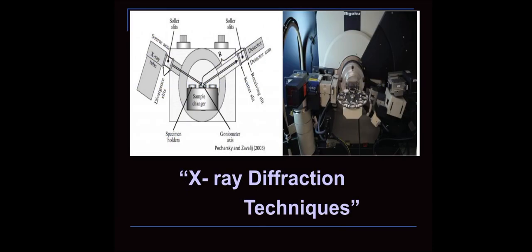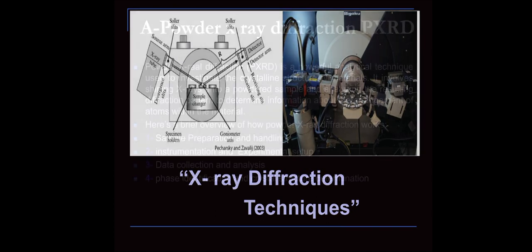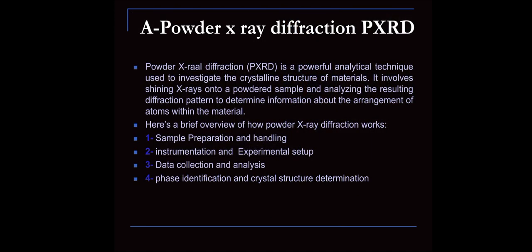Now I define X-ray diffraction techniques. This is a technique diagram of X-ray, XRD. First one, powder X-ray diffraction. This is a representation of PXRD.